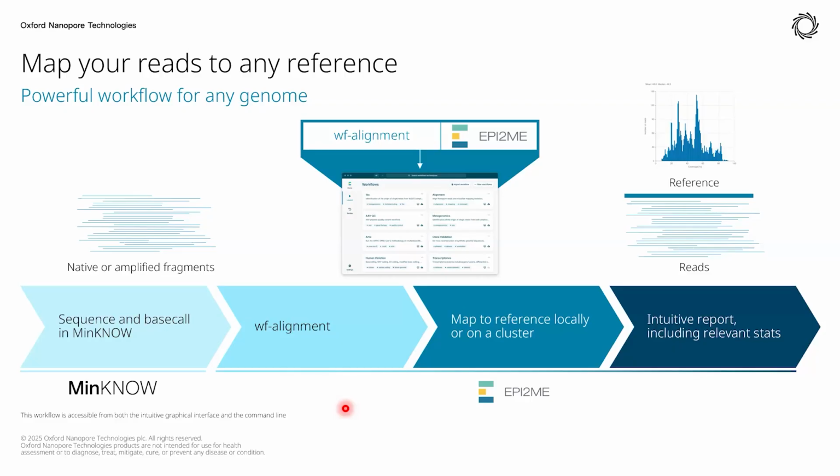You'll get a nice HTML report that will give you an overview of your sample, ideas about your fragment sizes and the distribution of those, quality score distribution, as well as alignment statistics. So it does provide you with extra information that you might have to get by further analyzing your alignment data with a third-party program. So yeah, there are some benefits to using it.